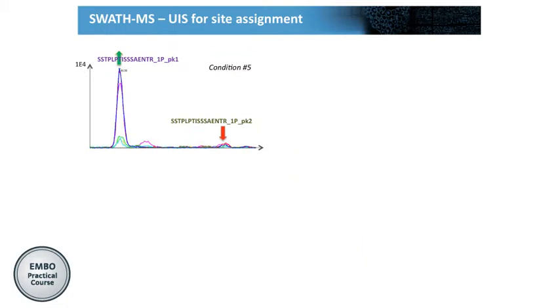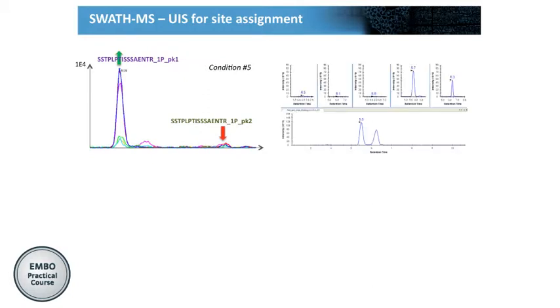Now back to this example, once we've done this quantification, we've quantified the peaks correctly. You remember I told you, let's use also the transitions. And in data-independent acquisition, as Ludo has shown you, we can go back to the data, reiterate, and try to extract those transitions that we're interested in. So as we did before, we said let's take Y4 and Y5 and measure them both. We need to think about it a bit in advance before we do the measurements.